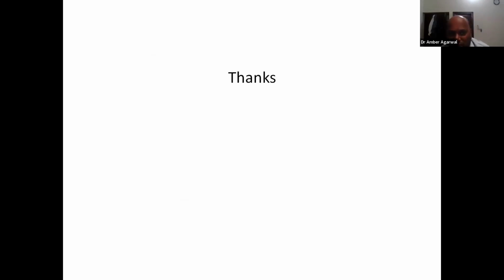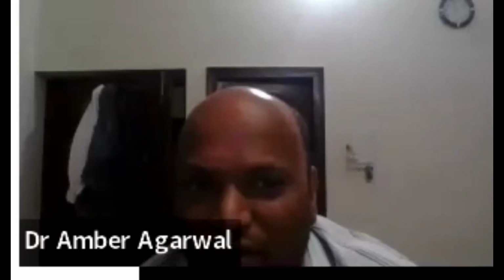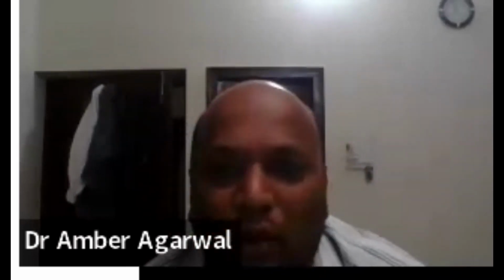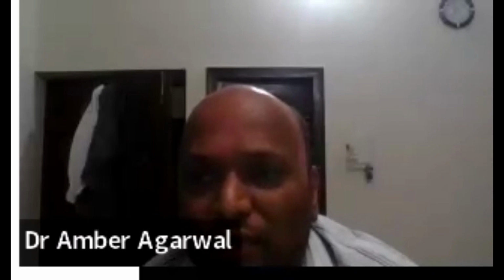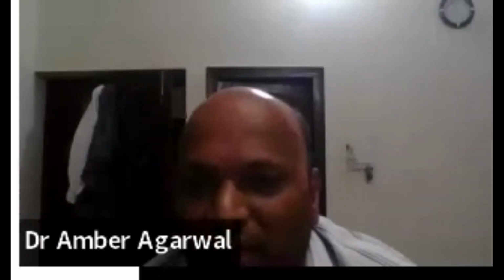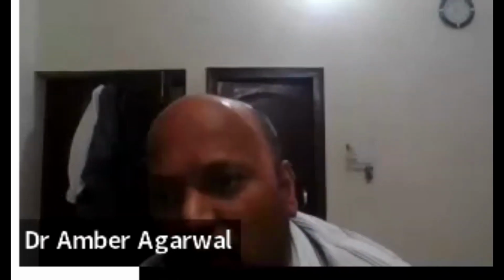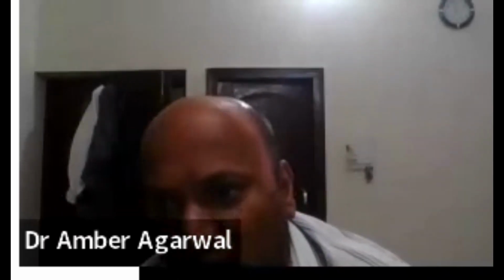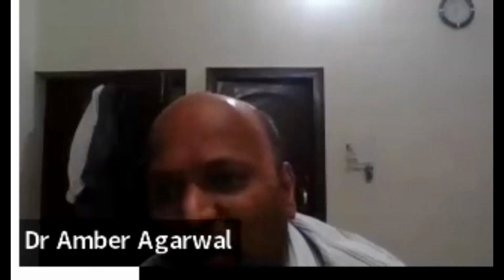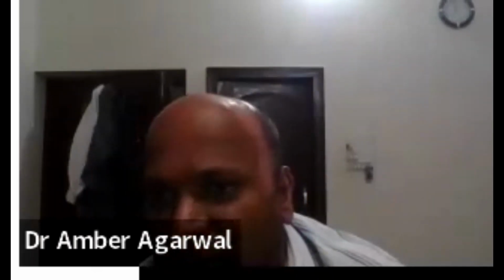Now, for 2 minutes, I'll talk about the KOH. I had not included it in this. In KOH, the most important thing is the sample sending. Usually somebody has sent a nail, and you put the KOH and you immediately see. KOH should ideally be seen according to the sample type.